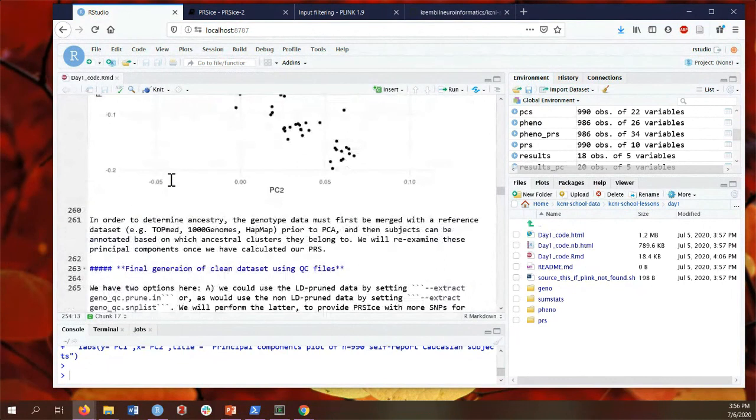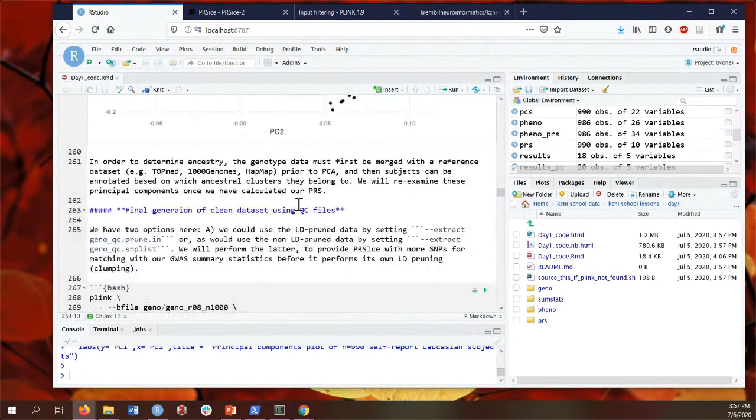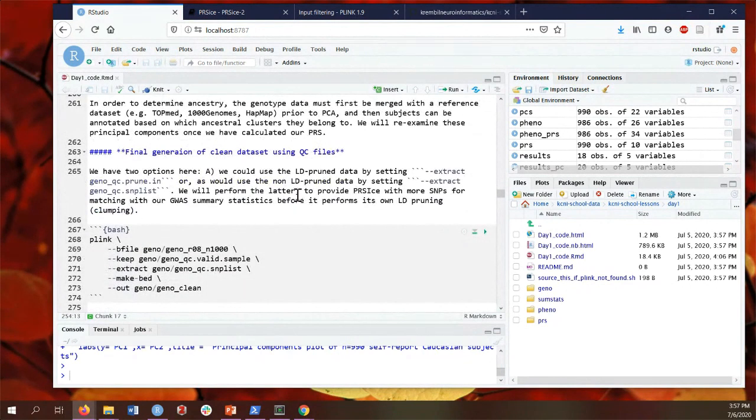Okay, so it's similar conceptually, but the way that the principal components analysis is done versus the compression in t-SNE and the dimensionality reduction, apparently this is a more optimal way of doing it, or preferred. Perhaps it's historical. It would be a great homework question. We'll bring you up on stage tomorrow, and you can tell us. I imagine it has to do with the quality of genotype data as opposed to the other, but maybe tomorrow you can come on stage and share your findings.